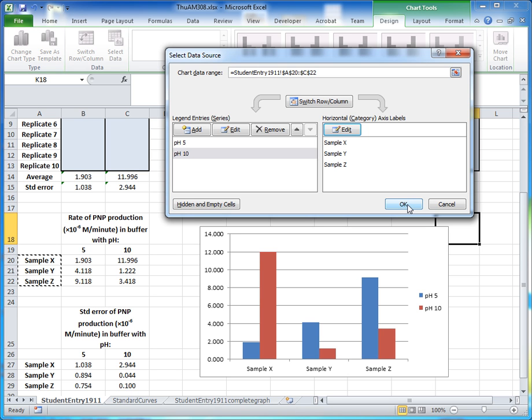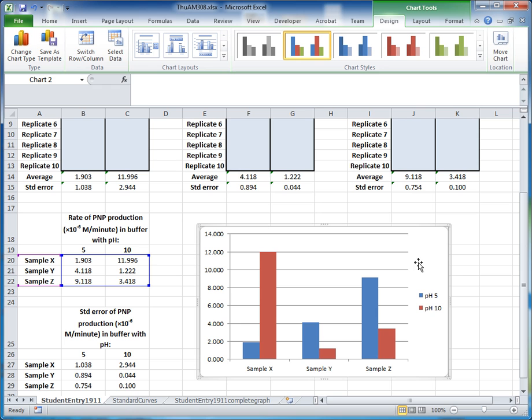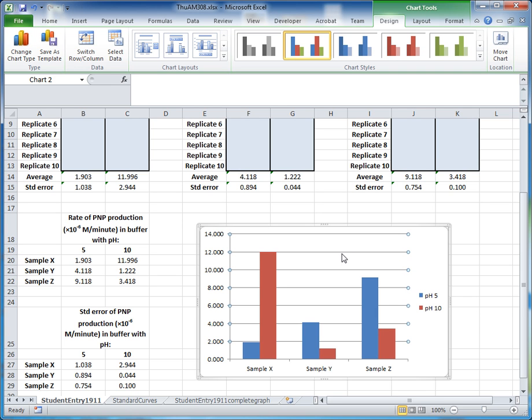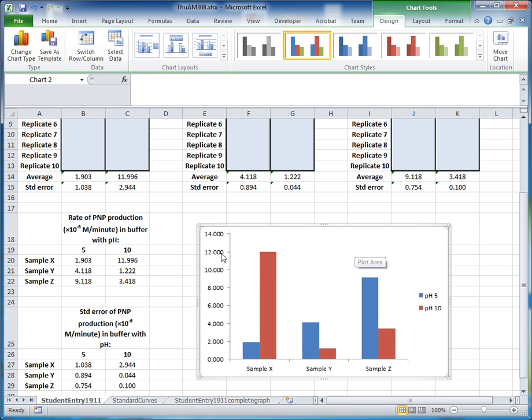Click OK to close the Select Data Source dialog box. The horizontal axis gridlines don't add much value, so click on them and hit Delete on the keyboard to remove them.